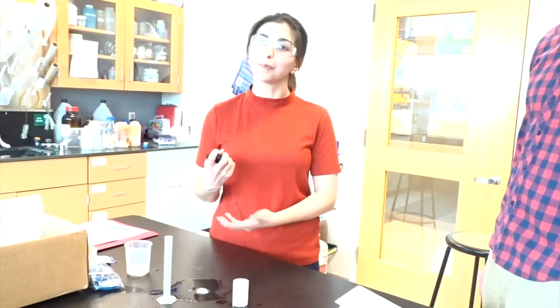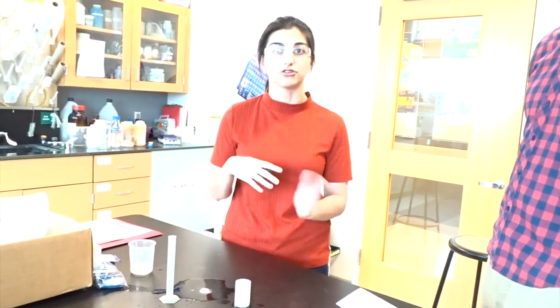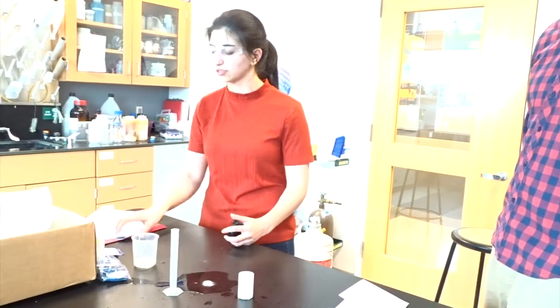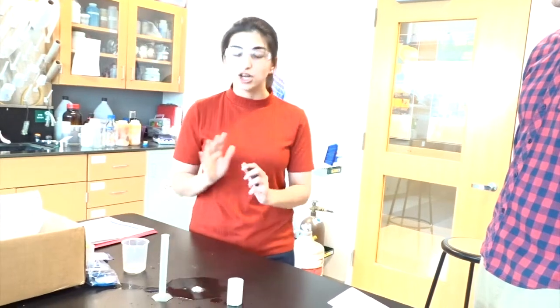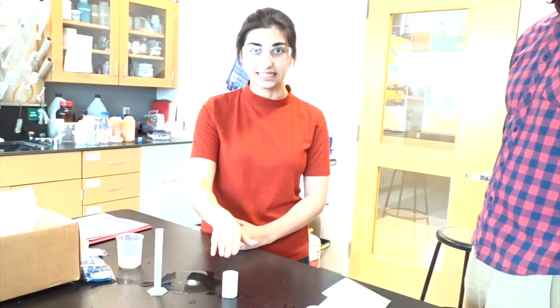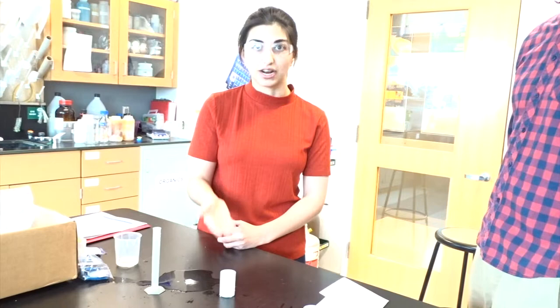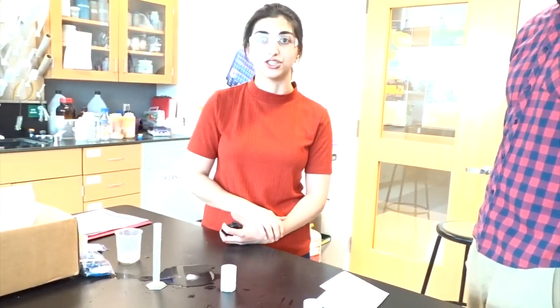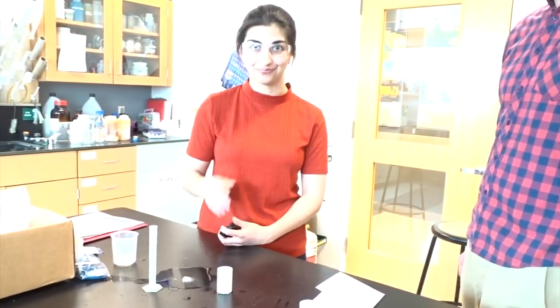So our reaction took about 30 seconds, and your reactions will probably take about that time, maybe even between 30 to 45 seconds. And the students can record that reaction time on their results table in their activity sheet. So we do want to make a note, though, that sometimes these containers, if the top is not on tightly, then there might be some gas leakage and there won't be as much of a buildup in pressure within the film canister. And if that happens, the reaction time can go as long as 1 to 2 minutes. So please be aware of that when the students are doing the reaction and tell them to be patient.